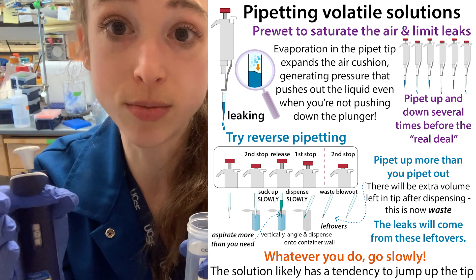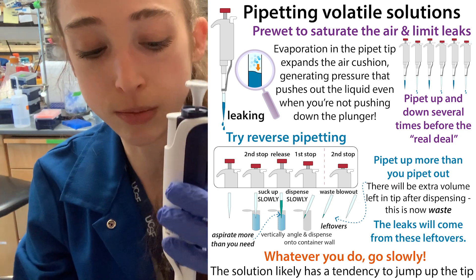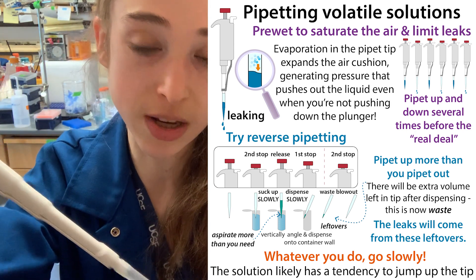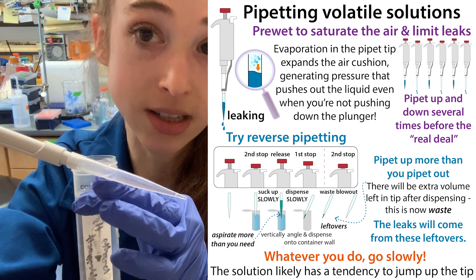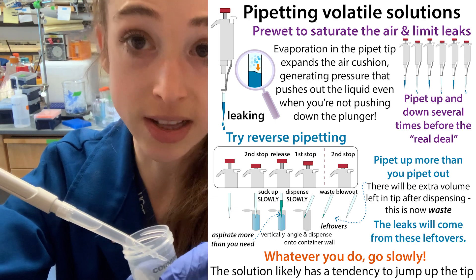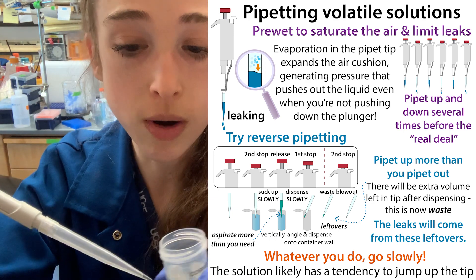One other option if you want to get fancy: they have positive displacement pipettes, where instead of an air cushion above your sample pushing it out, there's a disposable tip that directly contacts the liquid and physically pushes it out. That's another option, but it does require a whole different type of pipette.